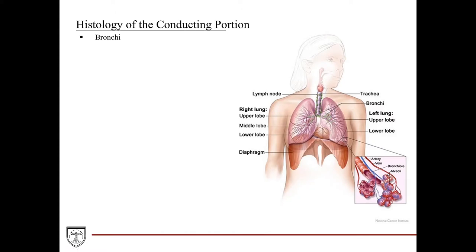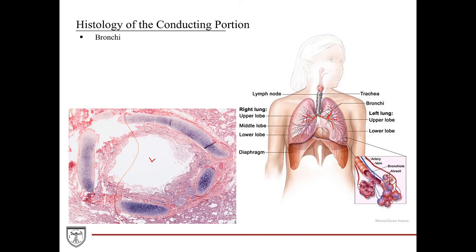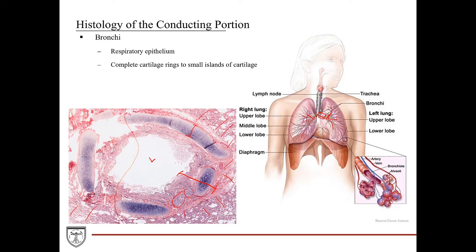The trachea eventually branches into the primary bronchi, which branch into secondary bronchi, then tertiary, and so forth — continuing to divide into smaller and smaller branches. Here's a histological section through a bronchus showing the lumen and surrounding lung parenchyma. The bronchial wall is comprised of respiratory epithelium lining the lumen, a lamina propria with glands, and deep to that, hyaline cartilage. This cartilage varies in shape by bronchi size: the primary bronchus has a complete circular ring of hyaline cartilage, while smaller distal bronchi have only a small plate or island of cartilage.